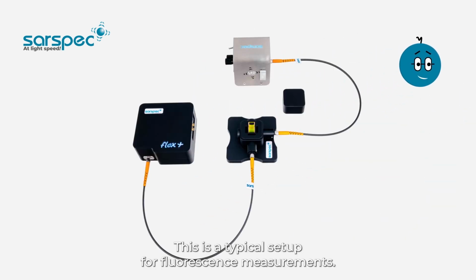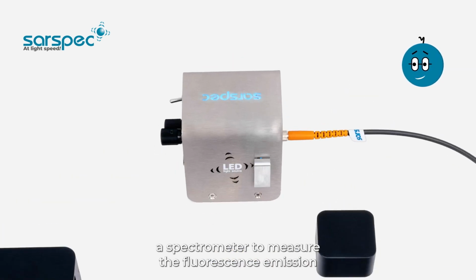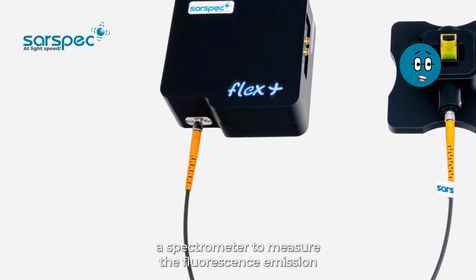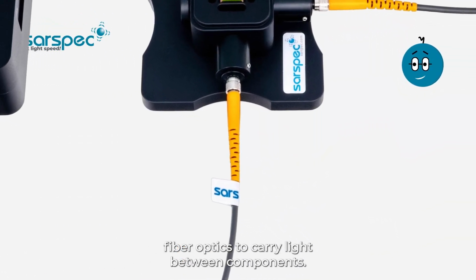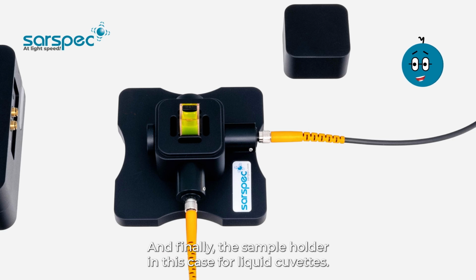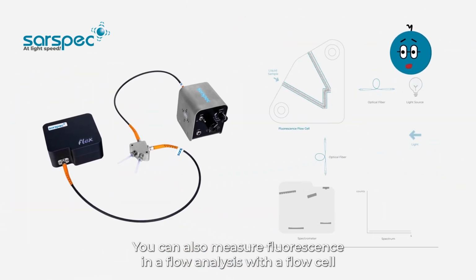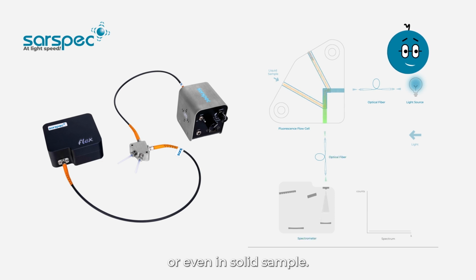This is a typical setup for fluorescence measurements. Here we have a light source for sample excitation, a spectrometer to measure the fluorescence emission, fiber optics to carry light between components, and finally, the sample holder, in this case for liquid cuvettes. You can also measure fluorescence in a flow analysis with a flow cell, or even in solid samples.